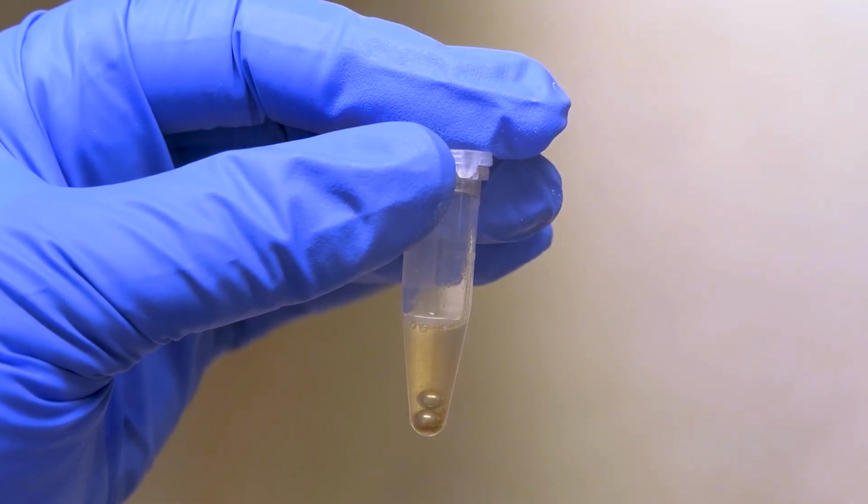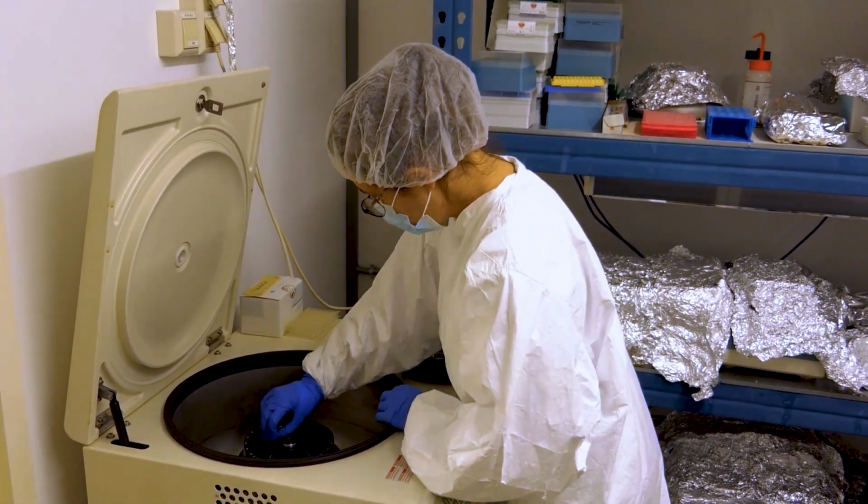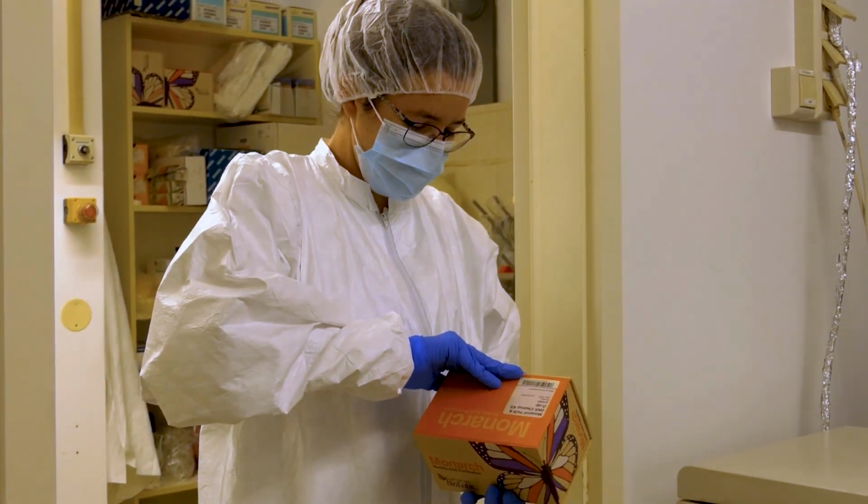Liquid-based free-floating scales in the lysis product may clog the silica columns later on, which is why we advise a short spin down of the sample to collect the scales at the bottom of the tube.